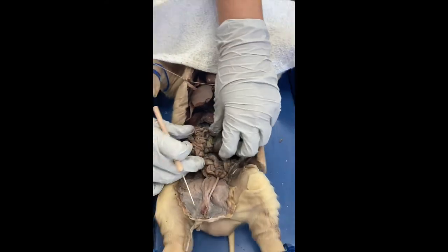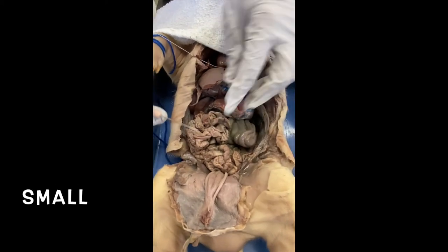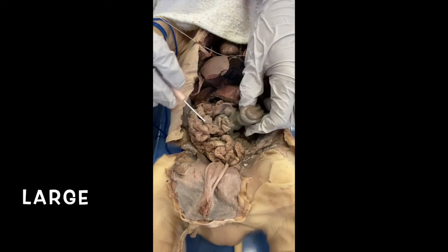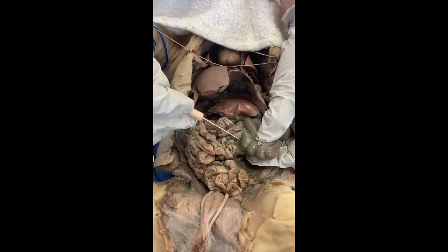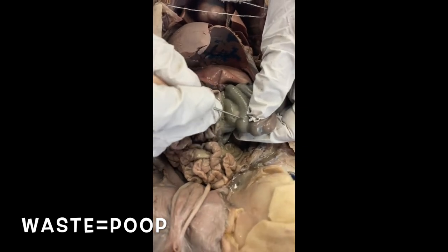We're going to move on here to our intestines. So smaller tube, small intestines, that's where about 90% of our food is digested. Here in the small intestines, and then here, large intestines. They appear darker in color. This is where our waste, y'all want to see that on camera? Maybe just a little bit. Yeah. Okay.